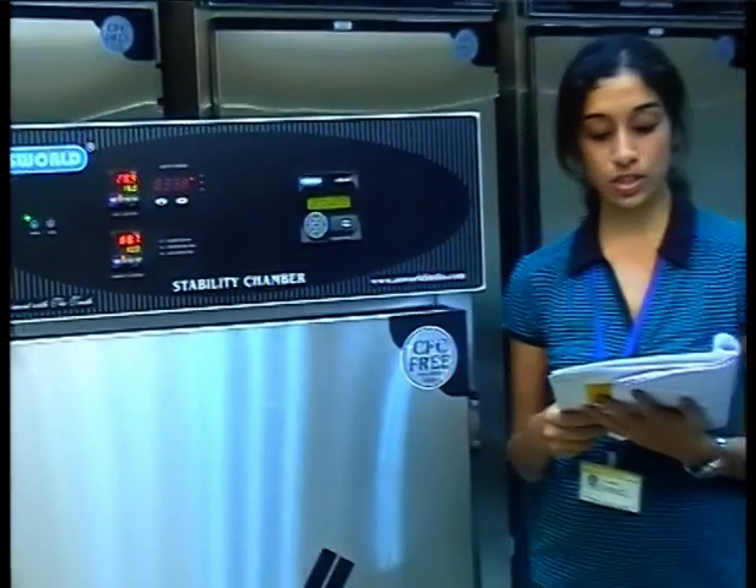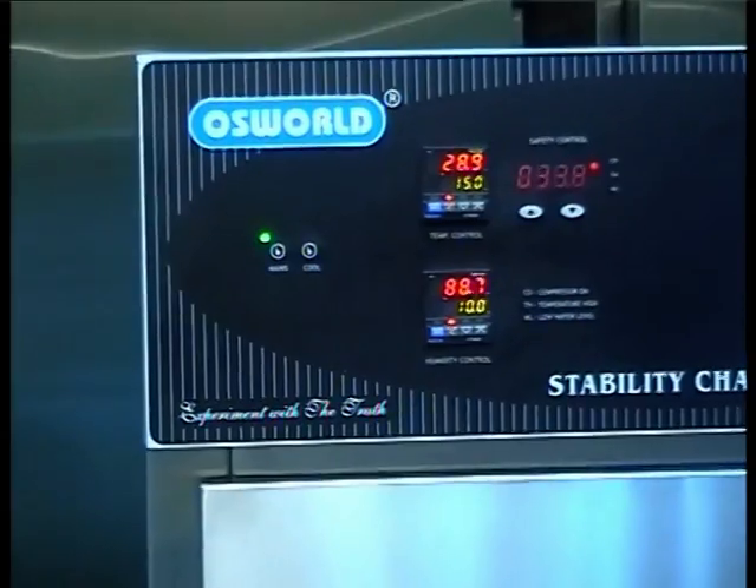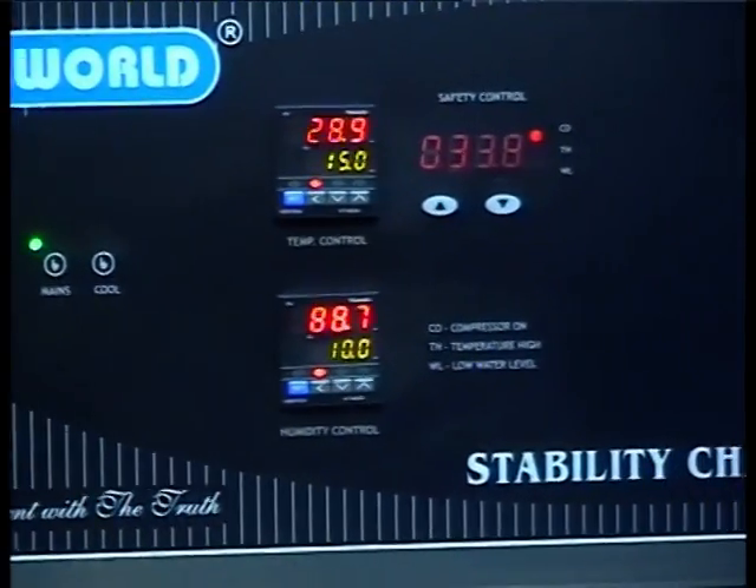If the temperature is achieved within the stated time, it means that the refrigeration system is okay. Moving on to the second test.